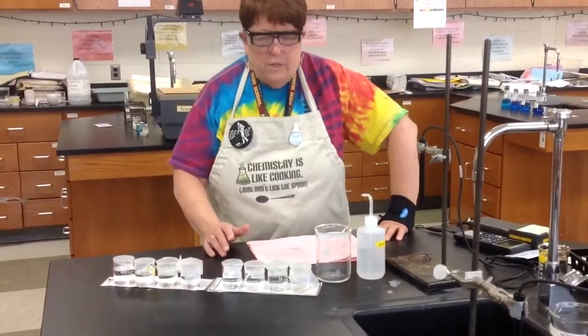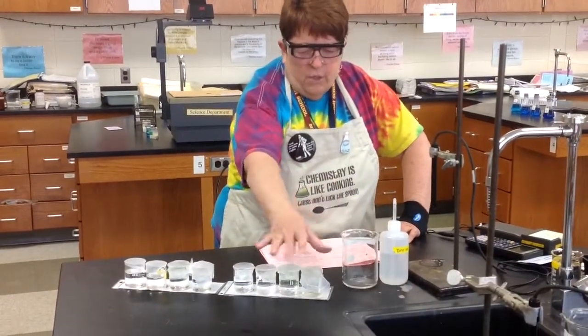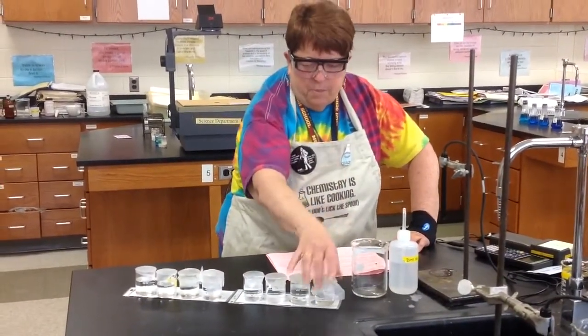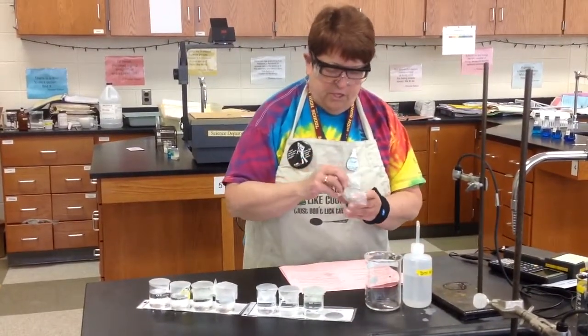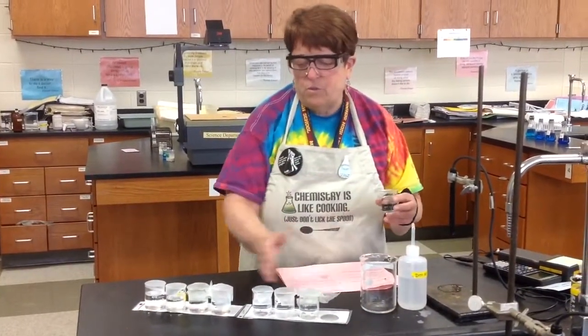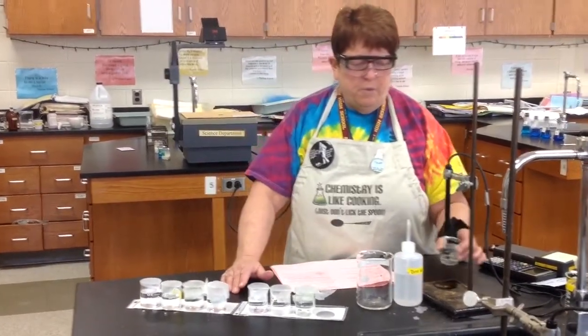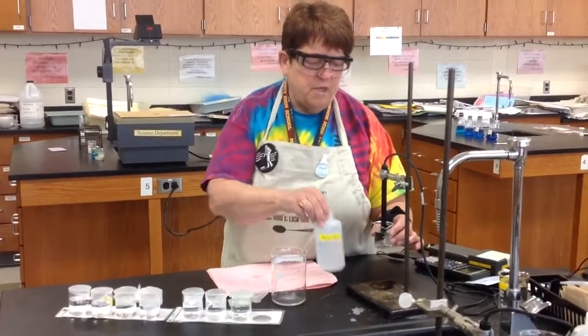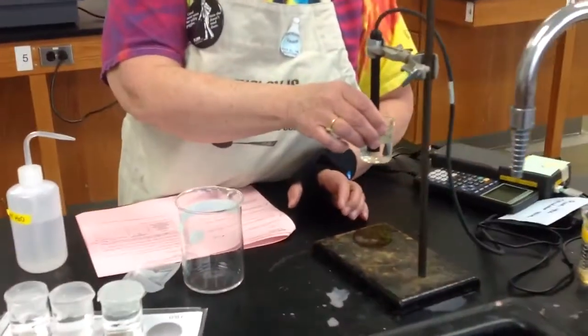Step 2, you do not need to do. It says place 40 milliliters of water in a beaker. It's already done. So we have beakers lined up here with all the things you're going to test. Distilled water is first. And for all of these, when you go to test them, just put the beaker under the probe. Make sure the probe is in the liquid. Swirl it around a little.